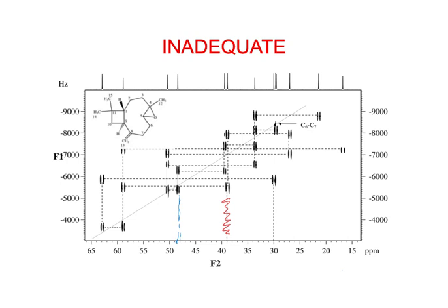Okay, so this is actually 9 up here, and the challenging part is that this other one coming in at 30, there's actually 3 peaks up in here, but one of them was 7. There's one of them up in here.